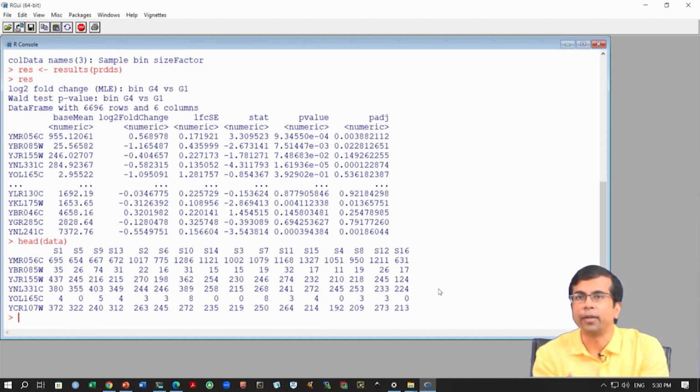Let us imagine you want G4 versus G3. What you have to do is maybe create a file with only G3 and G4, or reorganize this data so that G3 and G4 are in the first and the last columns. By default, when you have this kind of data, you will get the G4 versus G1 results. But this is what we want in our analysis, because G1 was the most interesting group, if you remember from the preliminary analysis. So, this is good, we have generated this data.